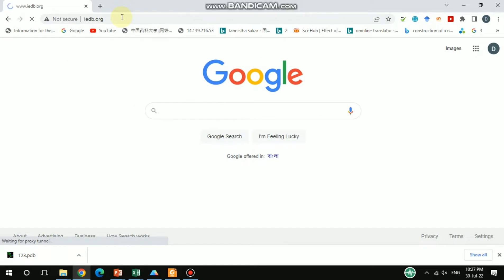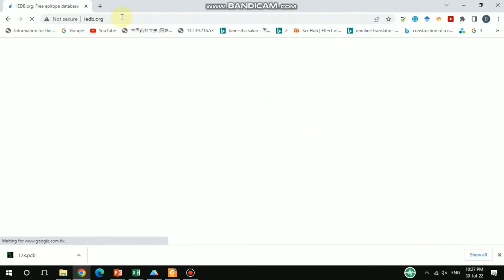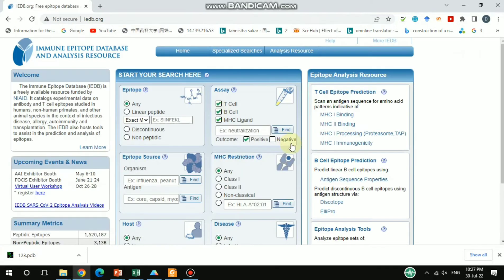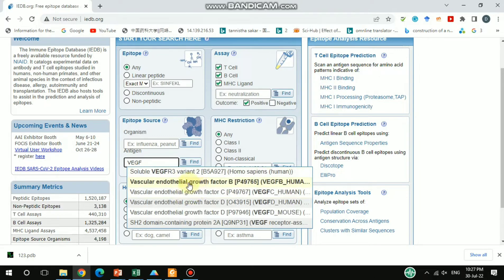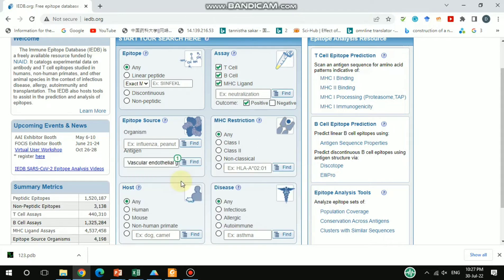This database is for epitope sequencing. This is the interface of the IEDB — the Immune Epitope Database and Analysis Resource. Here you can find several options. In the antigen field, you can type whatever antigen you want. For example, I'm going to search for VEGF, which is the angiogenesis-forming protein, so here I type VEGF B.